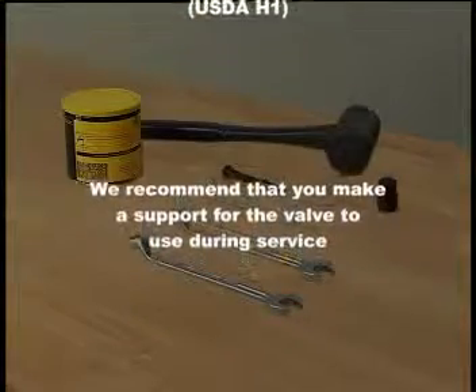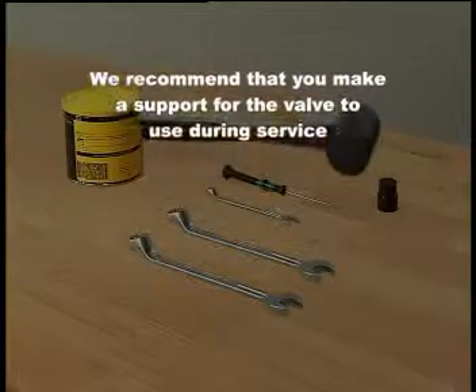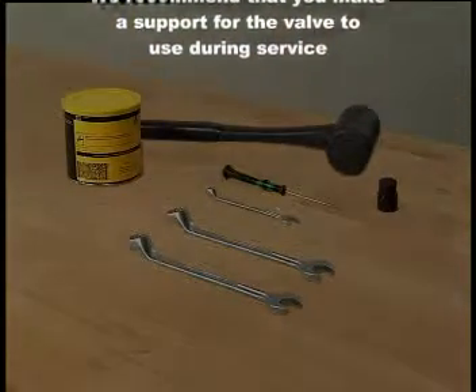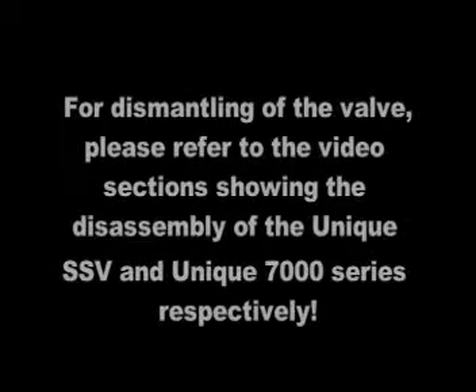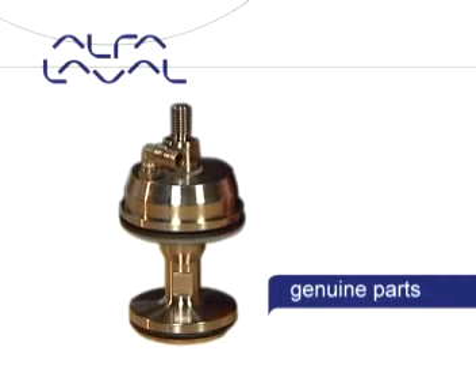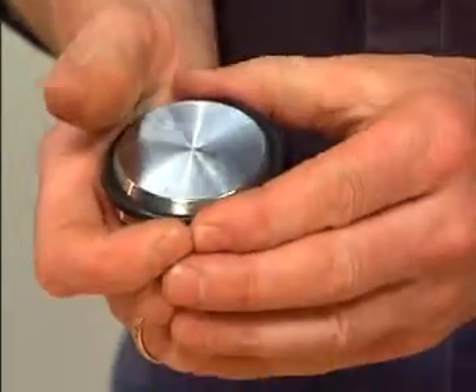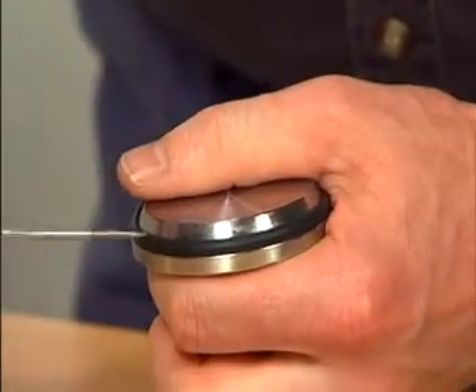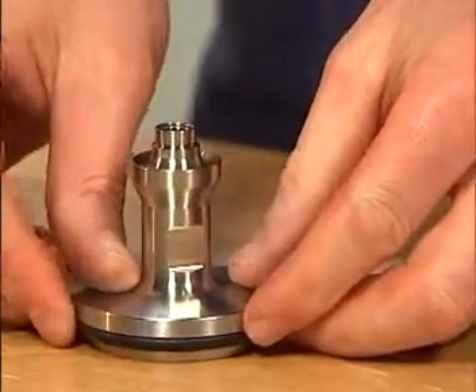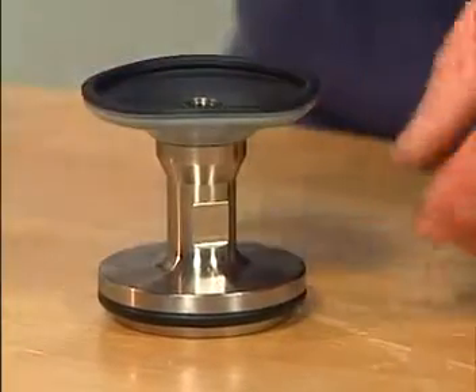We recommend that you make a support for the valve to use during service.